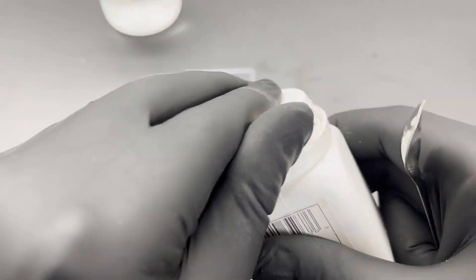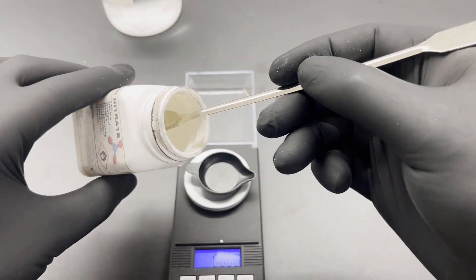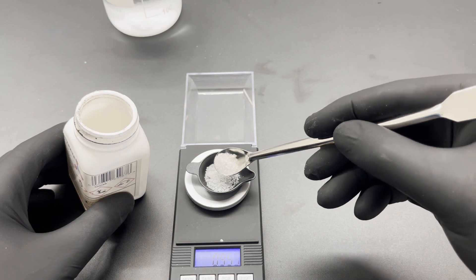Now 1.2 g of silver nitrate is weighed out and also dissolved in 100 ml of distilled water.